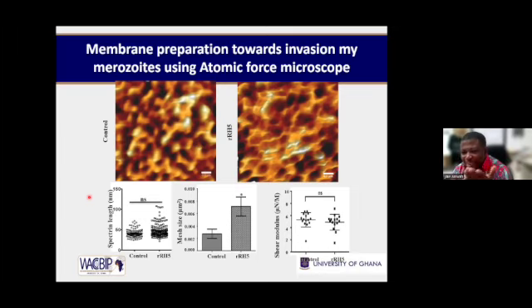So the other imaging modules, I didn't want to make the talk too long. We've done SIM, structured illumination. We've done expansion microscopy, looking at other things in the group. So I just limited it this way, but we're using all the different imaging modules that will allow us to achieve good resolution to enrich our research here. Yeah.